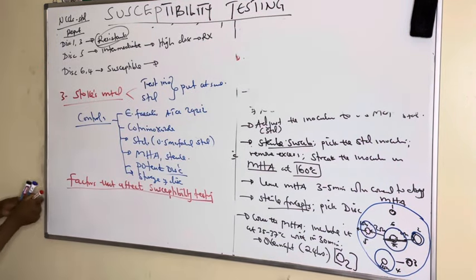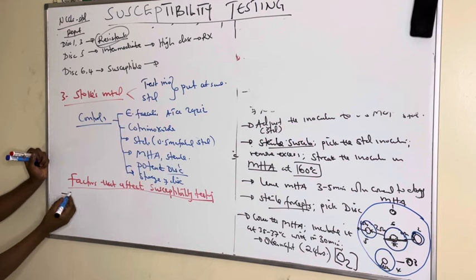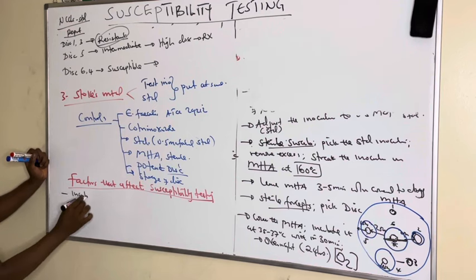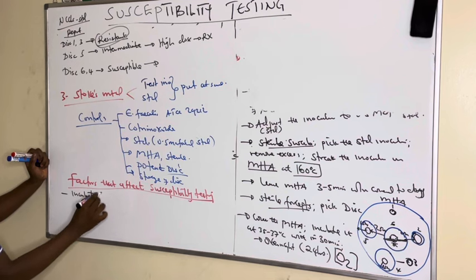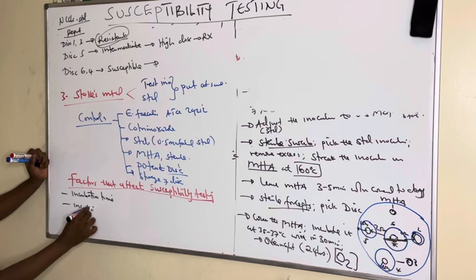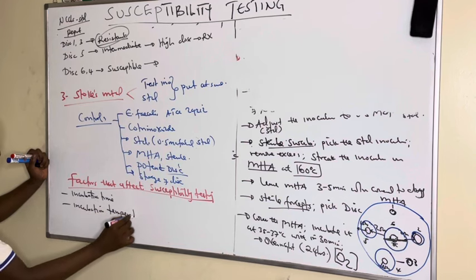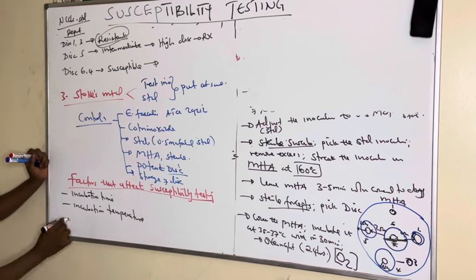One of the factors we can talk about is incubation time. We can talk about incubation temperature. We can talk about potency of the disc.